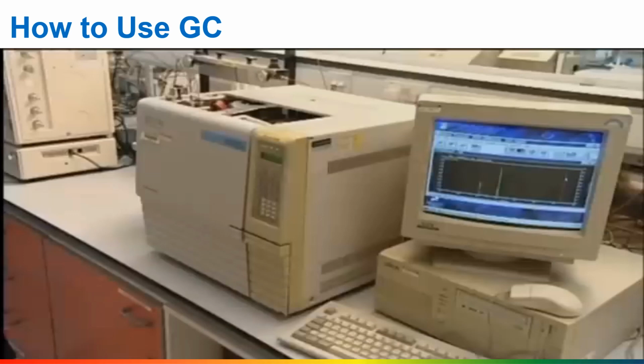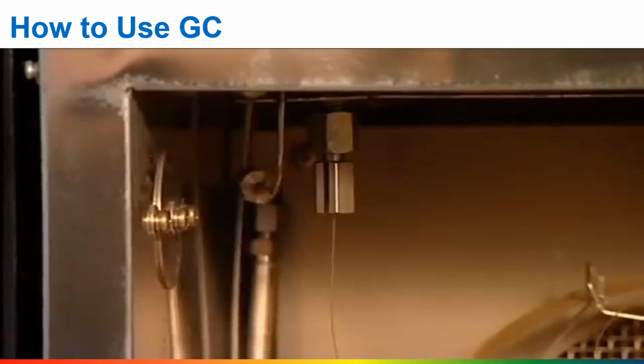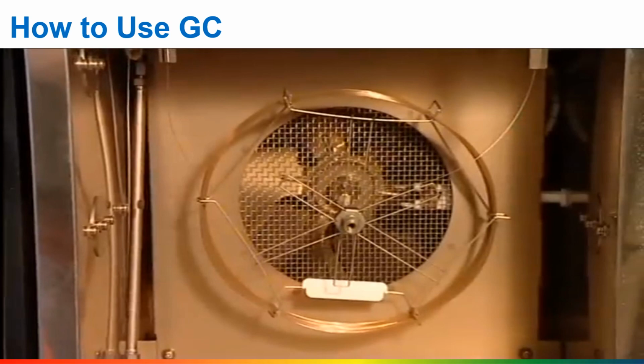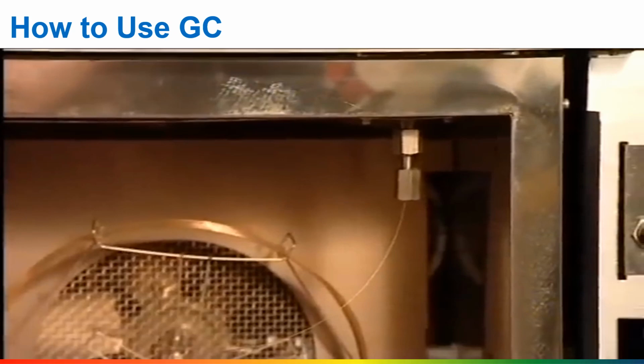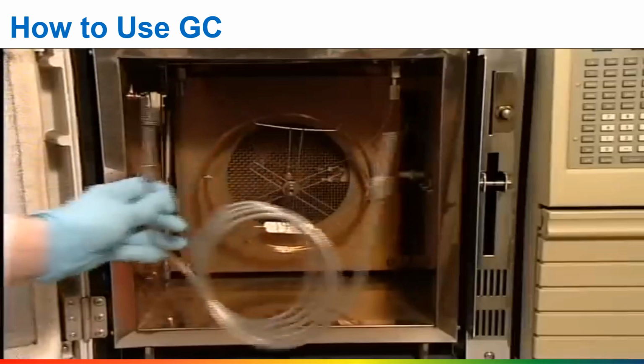This is the complete instrument, with a computer control system on the right. The sample is injected here. From this injection port, the sample passes into the column, which is kept in a temperature-controlled oven. Columns are normally wound into a spiral to save space. This capillary column is 30 metres long. This is much shorter, about 1 metre. The properties of the column and its filling are chosen for the particular separation that is to be carried out.